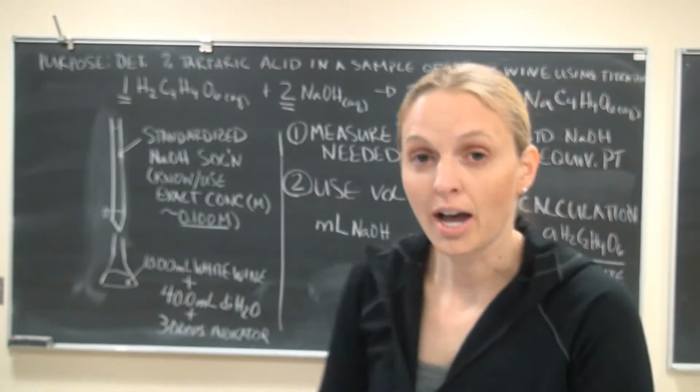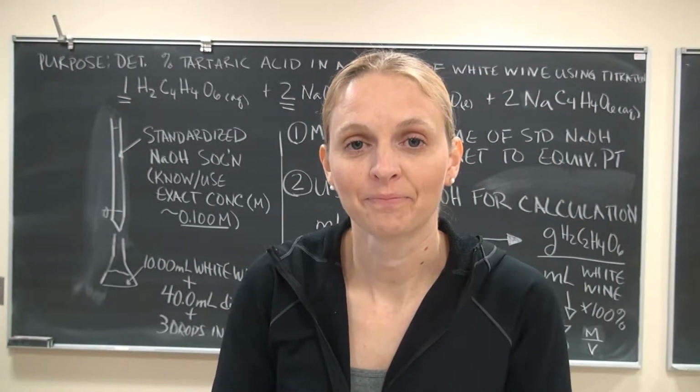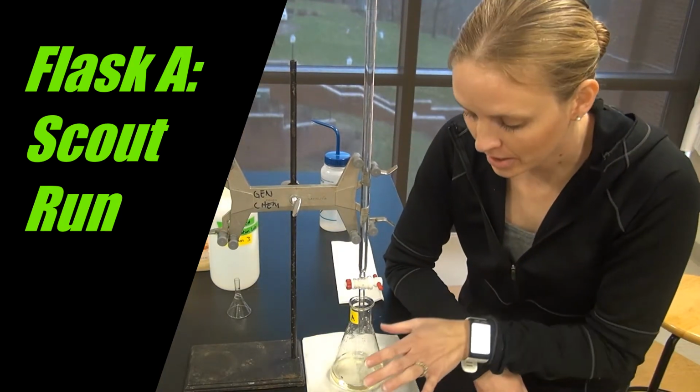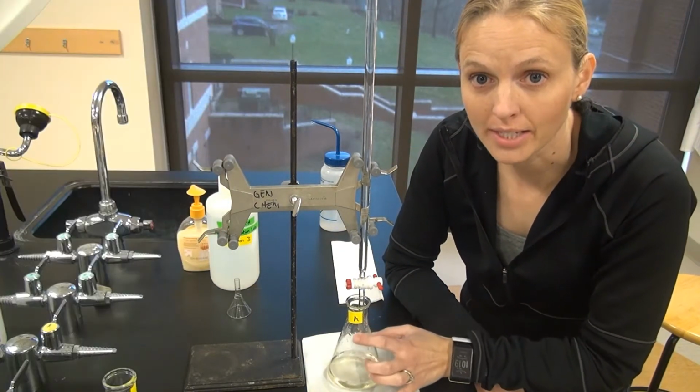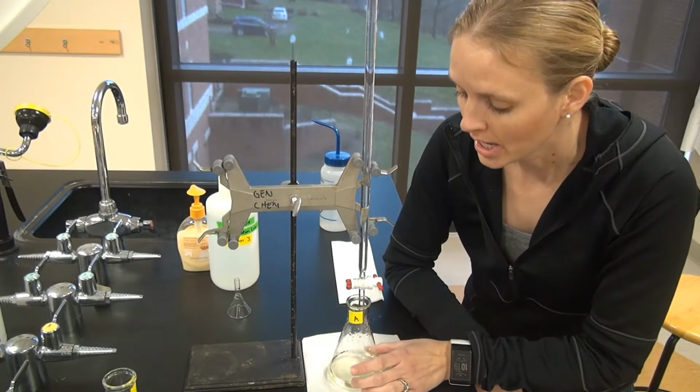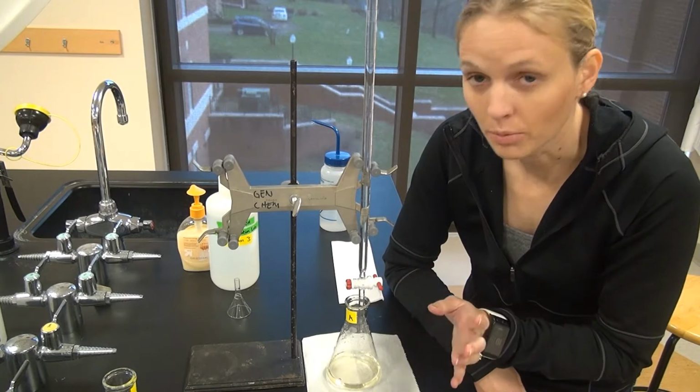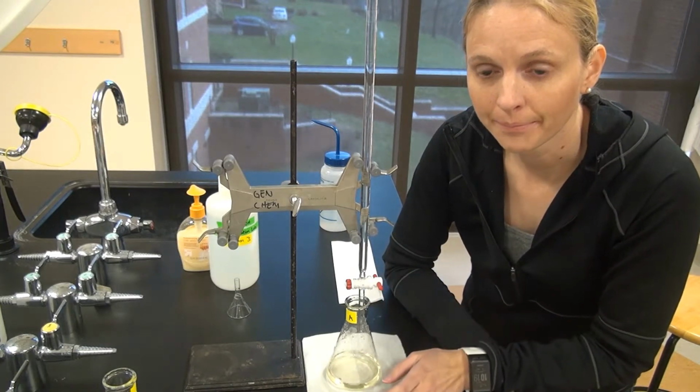All right, so now I'm going to video doing the experiment. Okay, so here's the setup. We have our sodium hydroxide up here. I have my A flask down here that's going to be my scout, and I'm going to open it full throttle and see when I get the color change, okay?